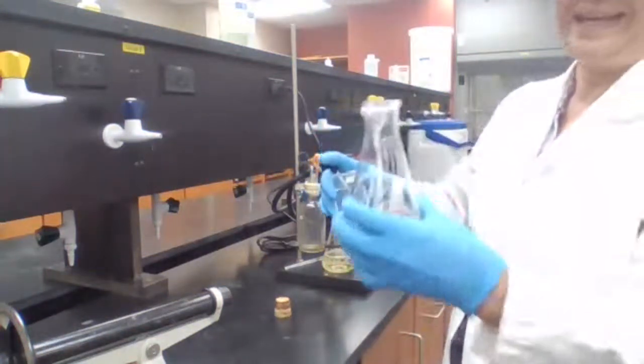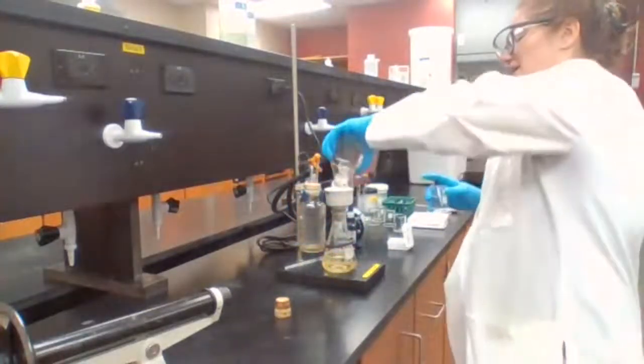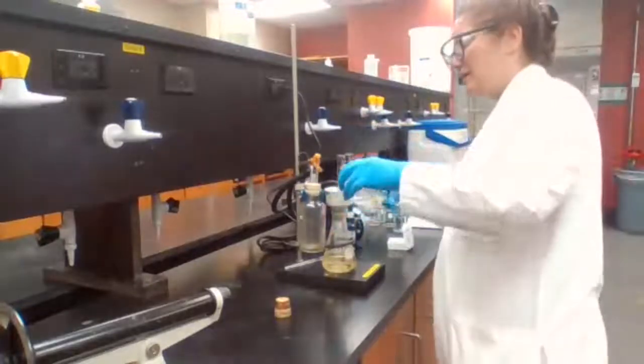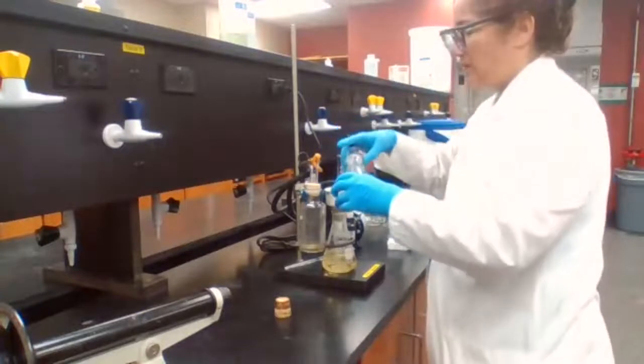This way, if there is leftover of the crystals in the flask, it will be transferred. At the same time, my crystals would be washed.